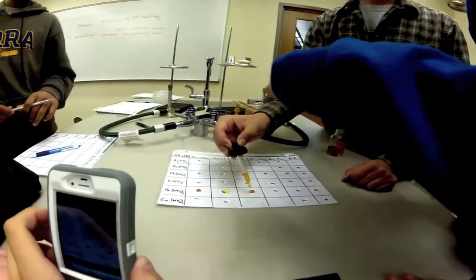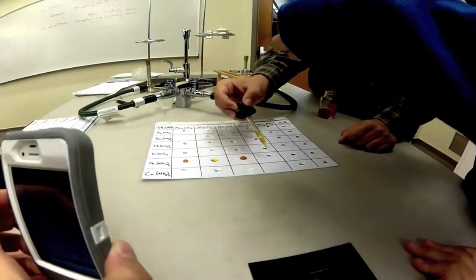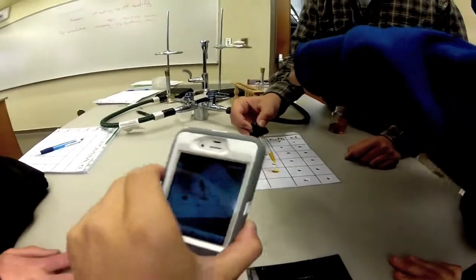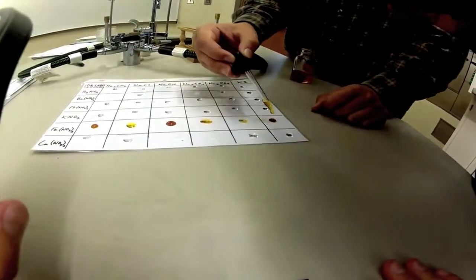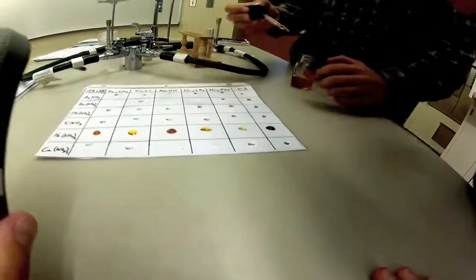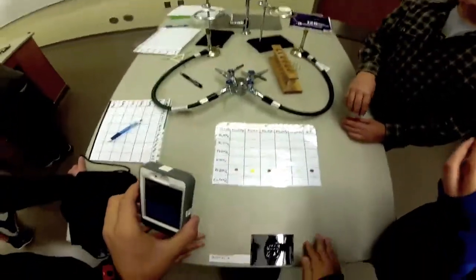The evidence of a chemical reaction here is the obvious change in color and the noticeable texture change in some of these, where some of them get that thicker look and the deep color change.